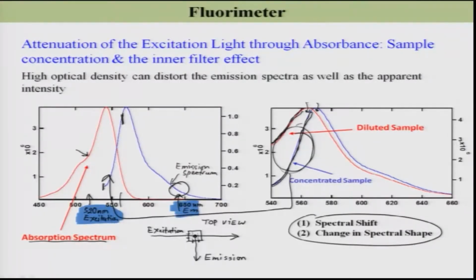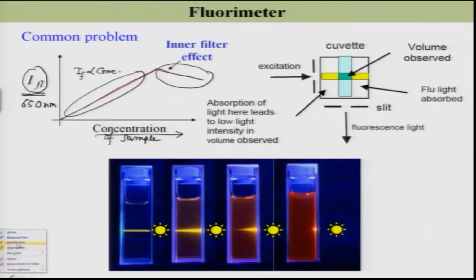So, here I am exciting and here I am monitoring. That is what I am going to do over here: 520 nanometer excitation and 650 nanometer emission. Still, what I am going to see is an increase initially, but then a decrease, and that can be explained with this photograph.